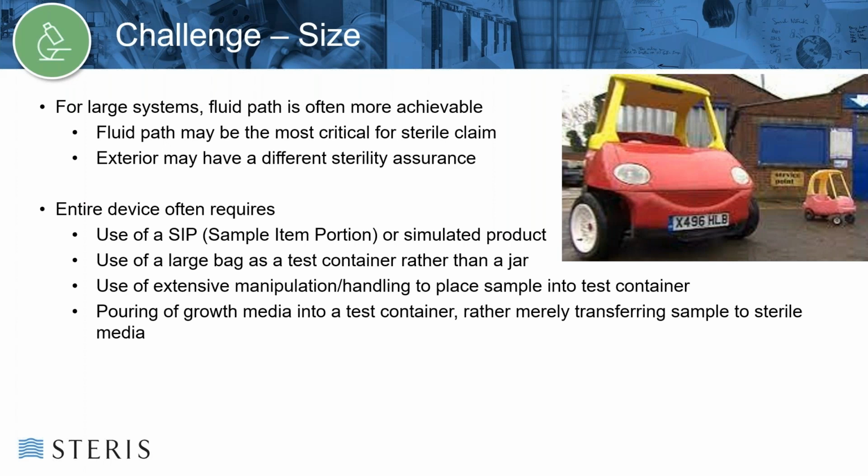The entire device, if we're testing it, often requires the use of a sample item portion or a simulated product, that being a smaller version of the actual product with all of the same components and materials, just at a smaller, comparable size or type of components.